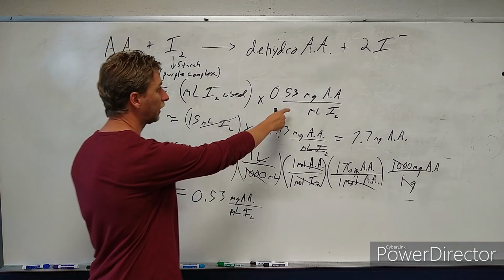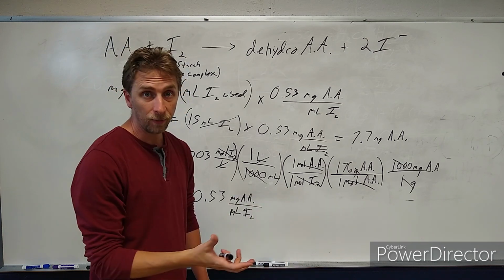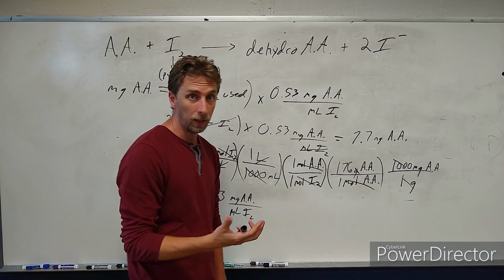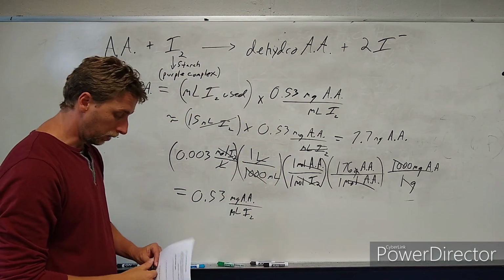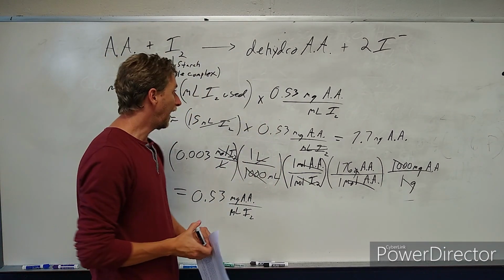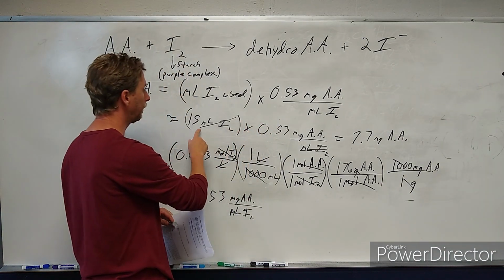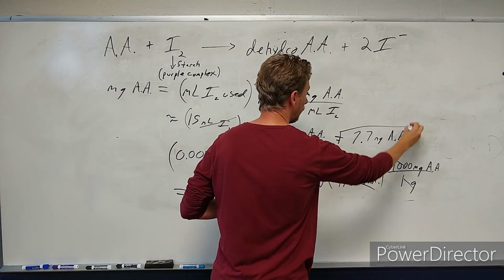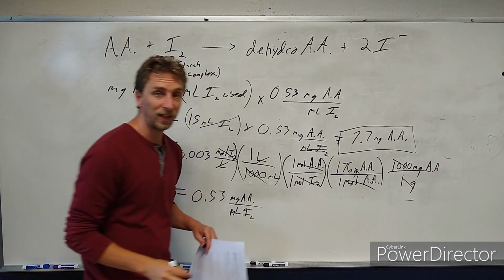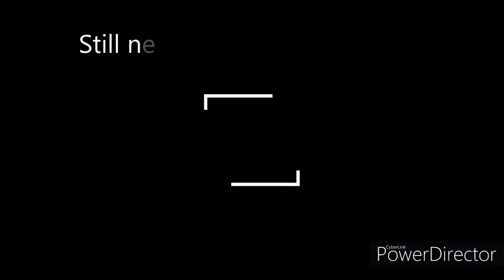So that's where this number comes from right there. That's our conversion factor between milliliters of iodine that we use in the titration and milligrams of ascorbic acid that we're going to say is in the solution after we multiply it like this. And remember, when we multiplied it, 15 milliliters times 0.53, if that was your result, then you would say, oh, it's 7.7 milligrams of ascorbic acid in that juice sample.